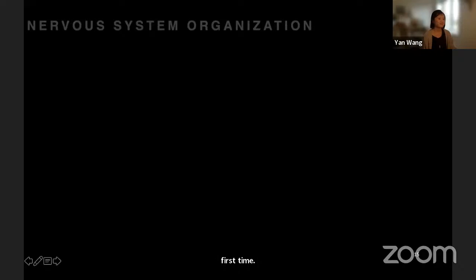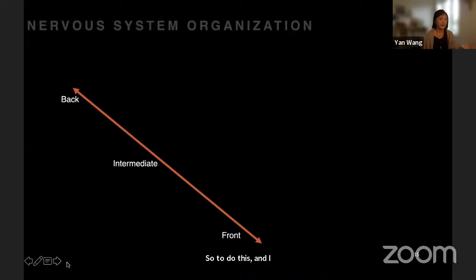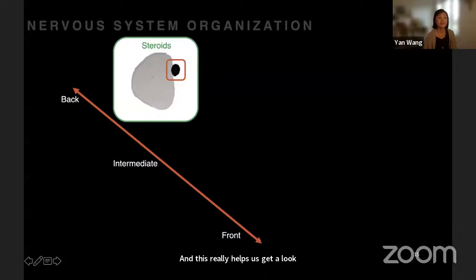We're now at this point, we're gaining a lot of data that the optic glands are very neurochemically diverse. And so from here, of course, I want to know, how does the structure of the optic gland, how does the neuroanatomy support all of these hypothesized diverse functions? So to do this, I designed custom RNA probes for these optic gland ligands, and I've been surveying their expression in the octopus nervous system using traditional in situ hybridization. And this really helps us get at localizing where these RNAs are expressed.